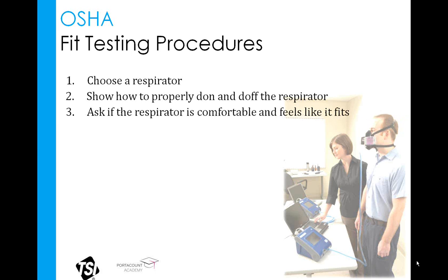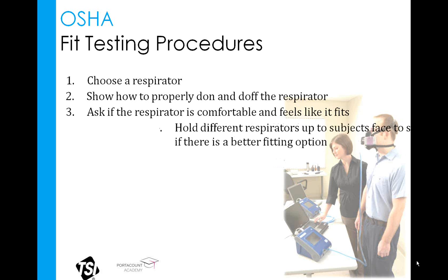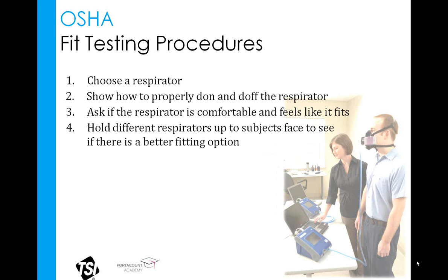Now step 3 is to ask if the person feels that the mask is comfortable. Does it feel like a good fit? And then step 4 is to try a different respirator if necessary. You could simply hold a respirator up to their face and see if it looks like it has a better fit, rather than having them don and doff each and every one.